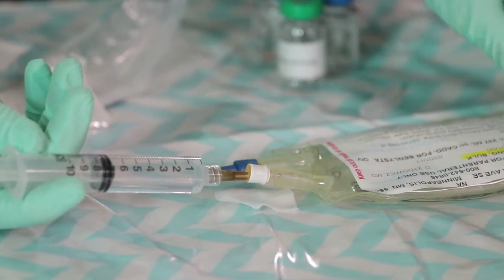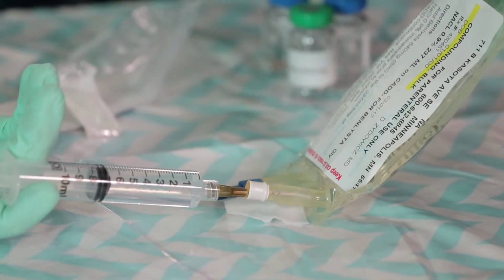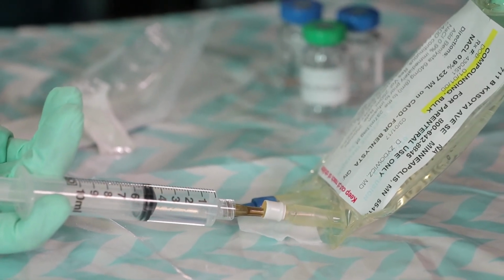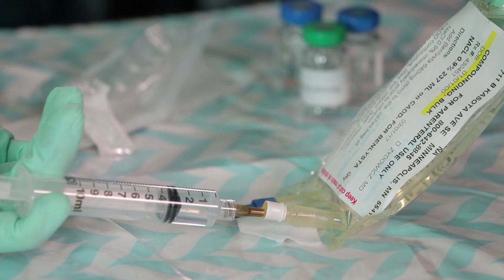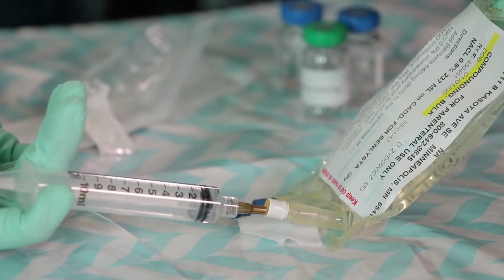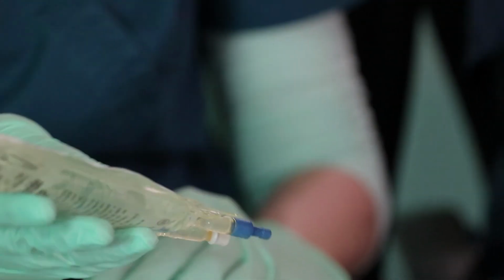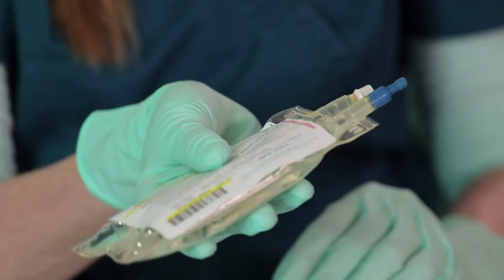When injecting the final solution into the bag, the best practice is to lift the bag up and insert the medication directly into solution. Gently mix the bag and inspect for particulate matter, cloudiness, or clarity. You are now ready to administer the bag to the patient. Administration must begin within 1 hour of mixing.